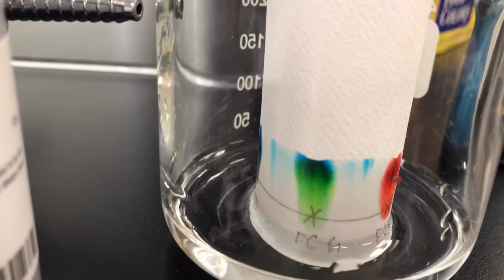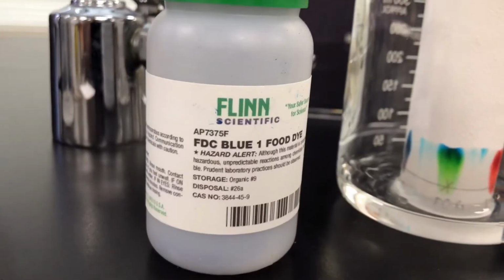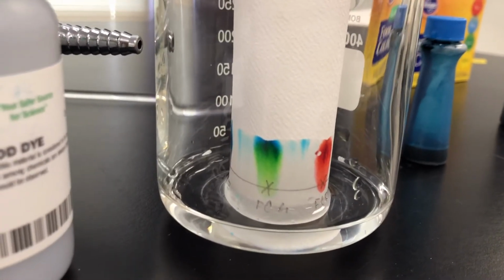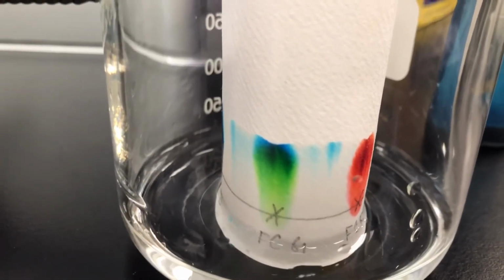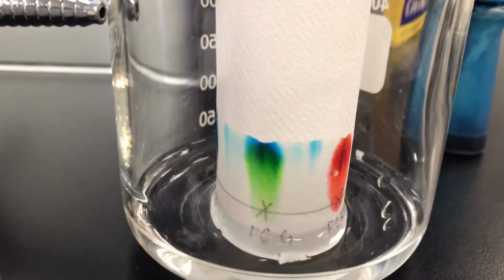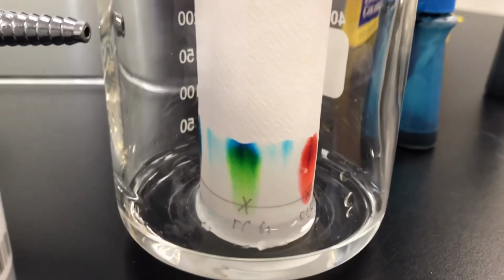So that is some error, that just that blue dye, whenever it comes out of this bottle, it comes out as a super fine powder into the air. So that's what you're seeing there. It's not something that was in the green. Now there's going to be some blue in the green food coloring because yellow and blue make green. But the stuff off to the sides, that is from the dust.